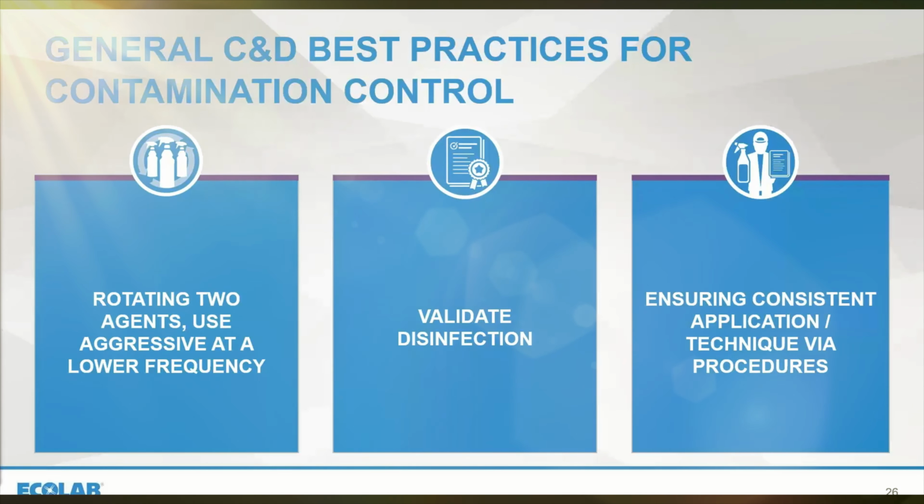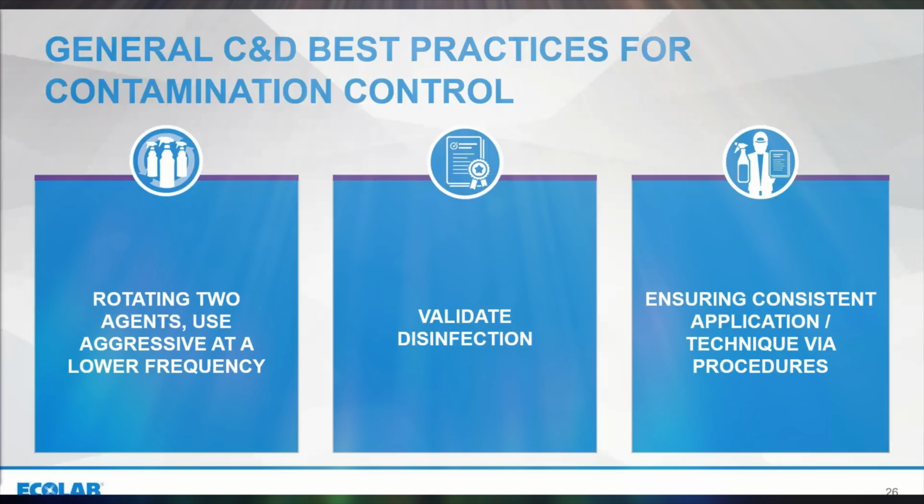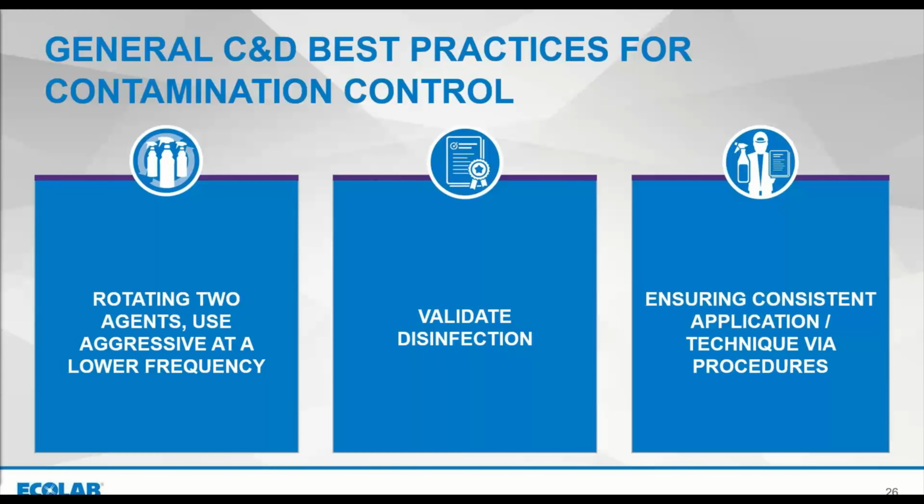And one of the most important things for manual disinfection processes is making sure that the application technique is consistent, because you need to get full coverage on all the surfaces, whether it's the surface of an item being transferred, a floor or a workbench. That way, where bioburden is present, it gets the appropriate contact with the disinfectant agent for the appropriate time. So it's really important to support your cleaning and disinfection teams with appropriate procedures and structured training so they understand the importance of doing that consistent process.